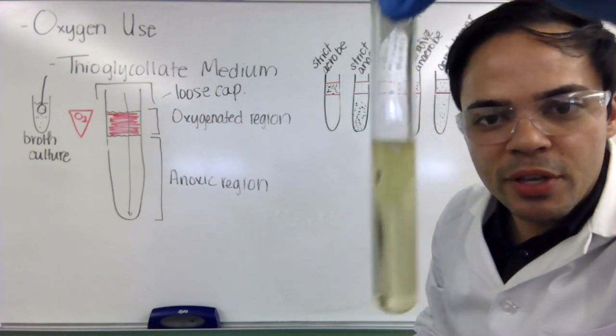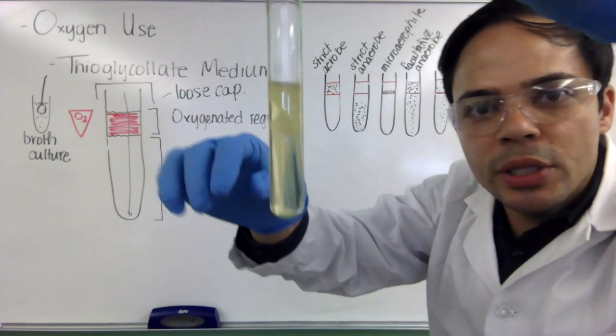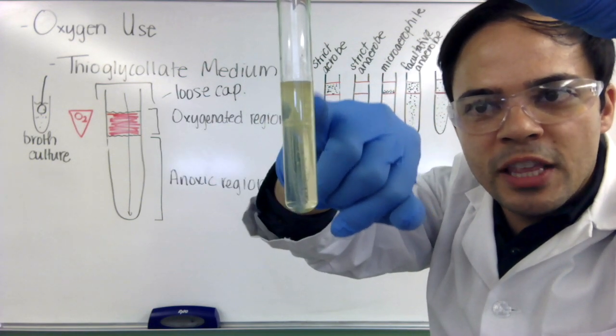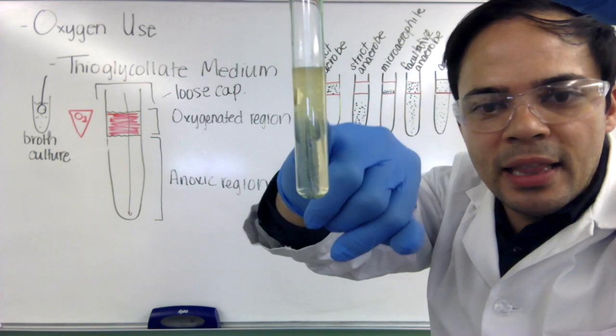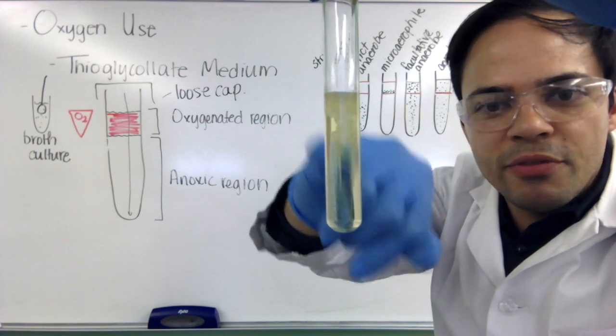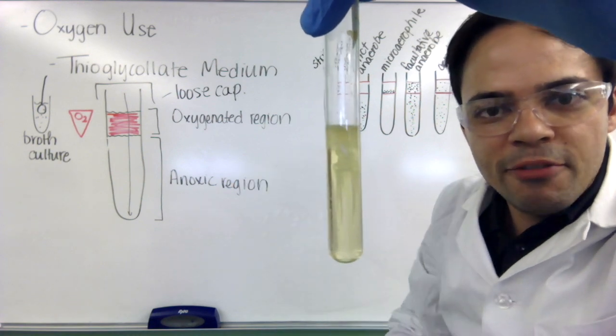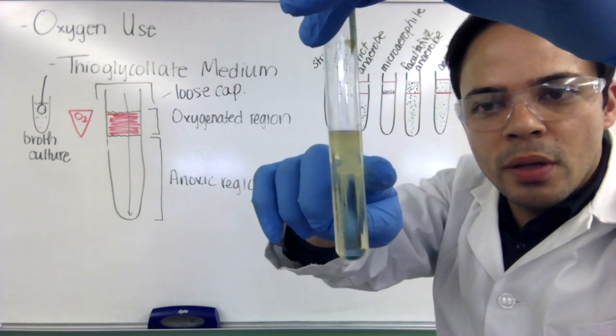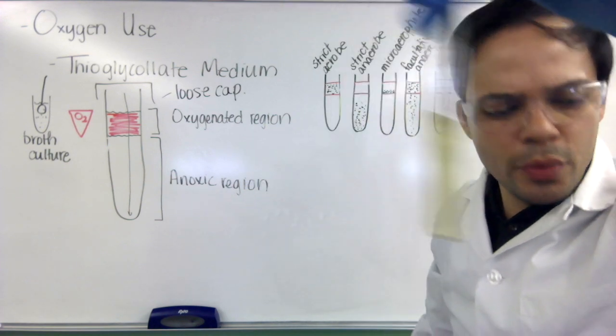And the next one we have here, you can actually see that on the top here in the oxygenated region, there's thick growth and then less growth at the bottom, but still growth. And it's actually in almost like a V-shaped pattern. So this I would say is a facultative anaerobe, grows really well with oxygen, but does not require oxygen to grow.